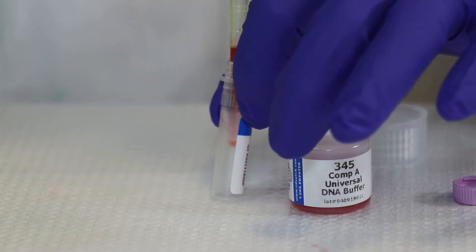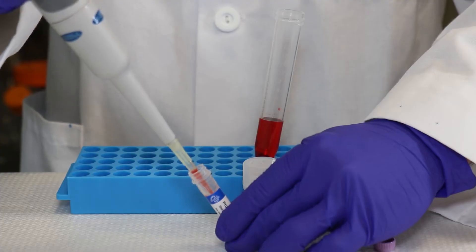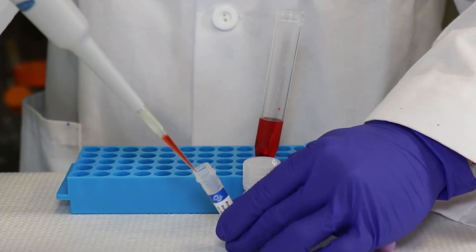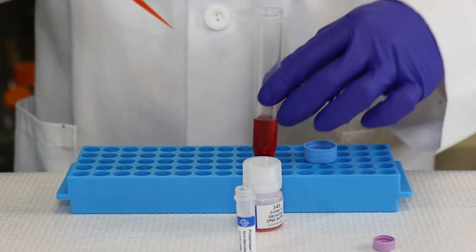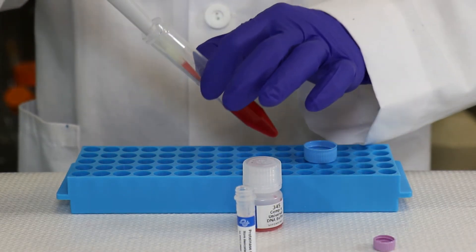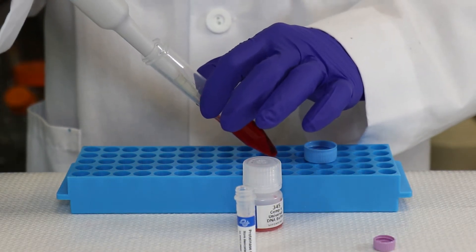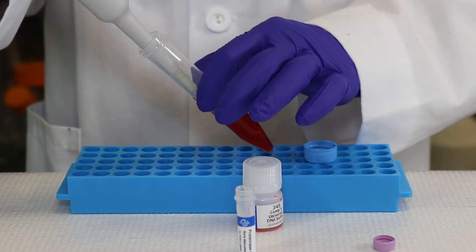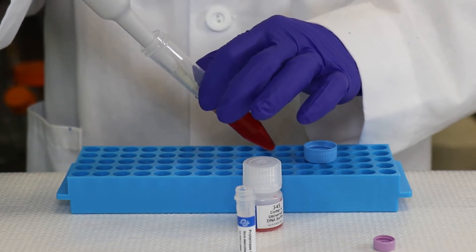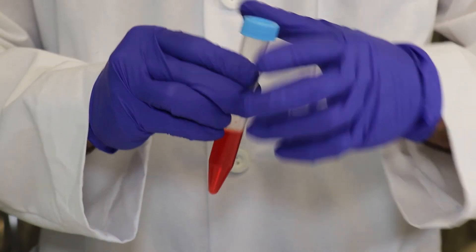Add an additional 4 milliliters of universal DNA buffer to the conical tube. Step 3: invert the tube several times to mix. Label this tube lysis buffer.